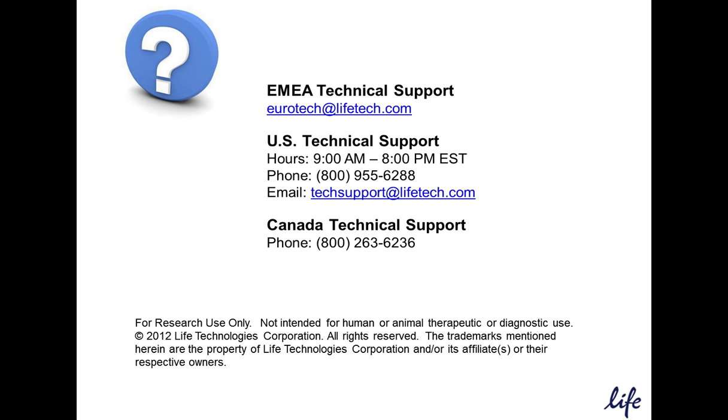There's a question about standard dichroic filters that are used in the flow system, and I'll have to refer you to the flow cytometer that you are using in particular. Typically, each one will have a standard set that are used to QC the instrument and make sure that it's functioning properly. Some systems are fixed and will not allow the system to be changed, while others are more flexible and will allow the dichroic filters and bandpass filters to be changed.